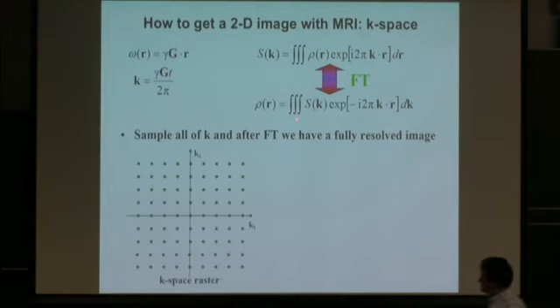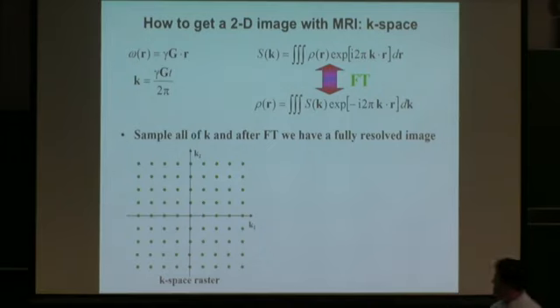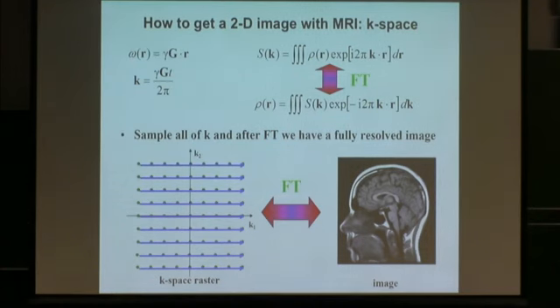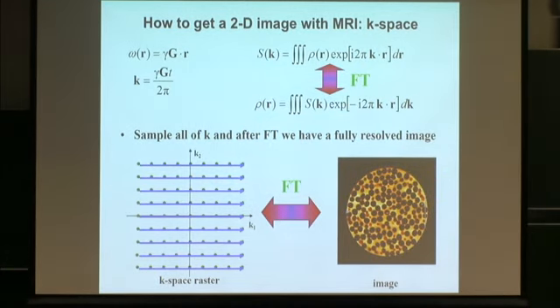So what we'll be thinking about is this type of two-dimensional k-space raster. It could be three-dimensional for a 3D image in reciprocal space. If we acquire our signal as a function of these different values of k, where k is just the time integral of the gradient waveform, we can design sequences to acquire those data points in different ways. This is on a nice rectilinear grid that I've shown here. We just do a Fourier transform and that extracts the image. Or in our case, more likely to be something like that, which is a porous material. We've got glass beads which aren't giving us any signal, and we're filling the void space here with liquid water, and we're getting the signal from that.